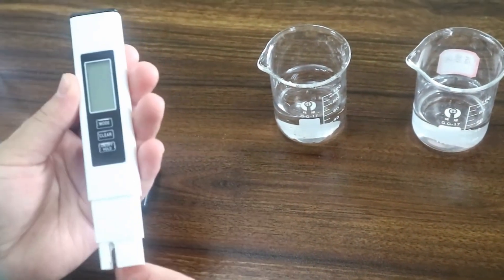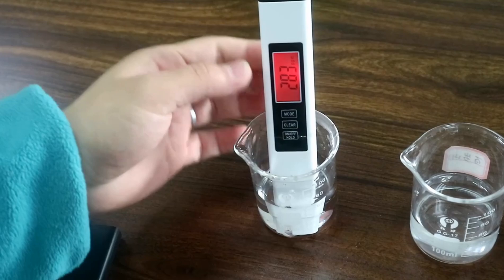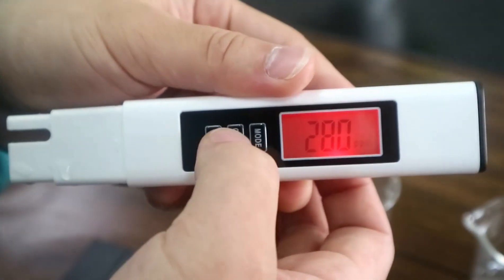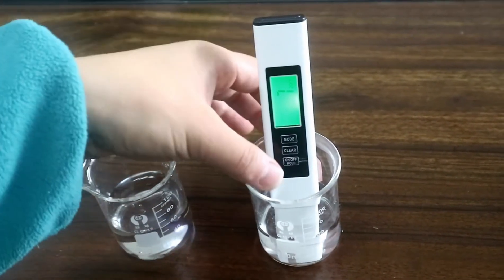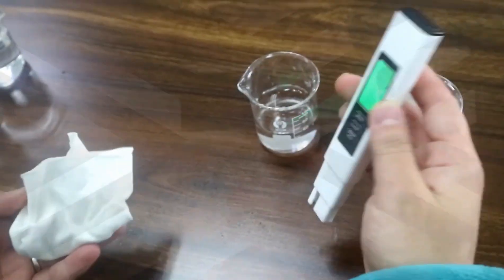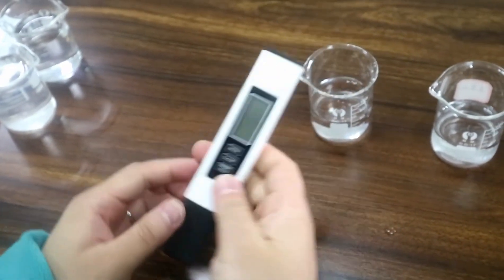Testing your water has never been this simple and straightforward. Have a great day.